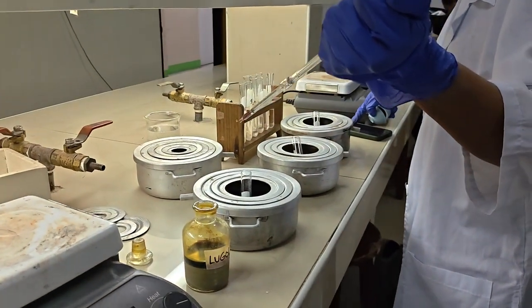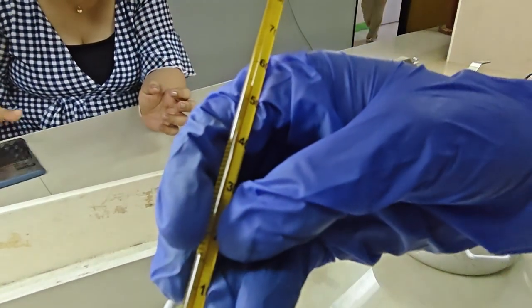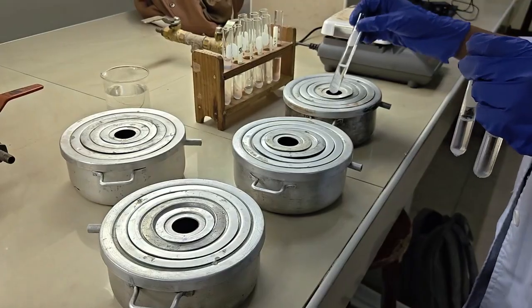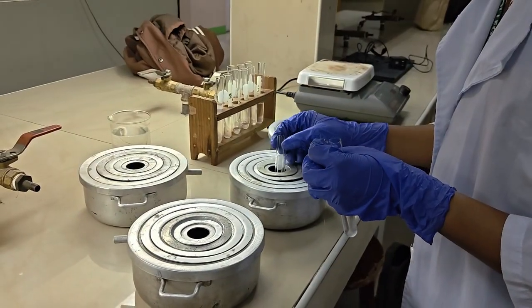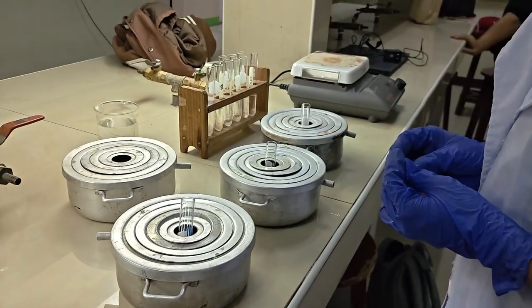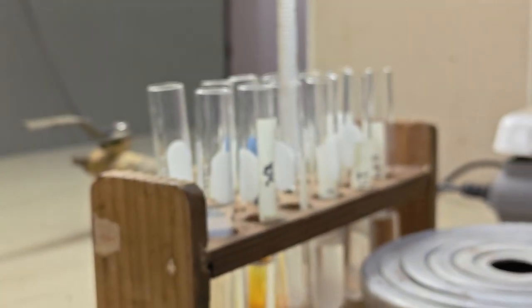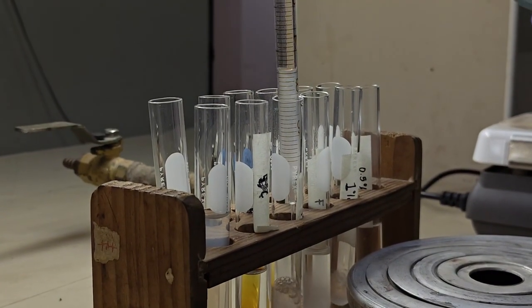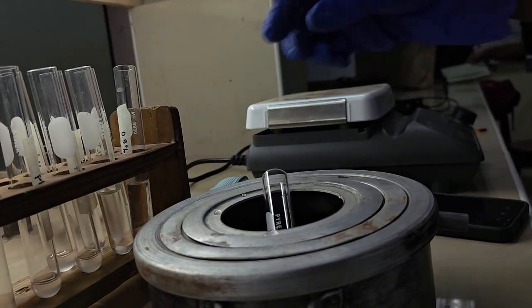For the first experiment, which is the effect of temperature, we tested how temperature affects the activity of salivary amylase. 4 test tubes were labeled according to their temperature conditions, which are test tube A for 5 degrees Celsius, test tube B for 25 degrees Celsius, test tube C for 37 degrees Celsius, and test tube D for 60 degrees Celsius. Each tube received 5 ml of 1% starch solution and 1 ml of filtered saliva. The solutions were mixed gently and placed in their assigned temperature conditions for 5 minutes.